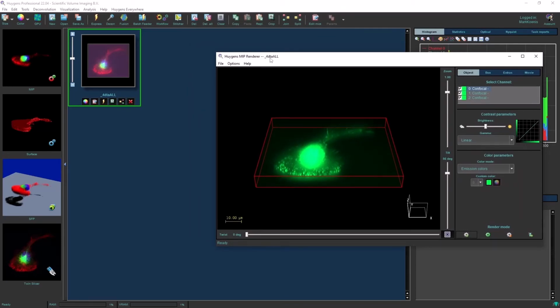Under the default settings, intensities in each channel are mapped to their emission wavelength, so that we are presented with a somewhat natural image. However, we can use the color mode selection box to change the way in which the intensities are mapped, for instance to a heat map. Note that for many mappings, using multiple channels can result in unexpected coloring and even clipping of colors. To reduce these effects, lower the number of channels or simply adjust the brightness.